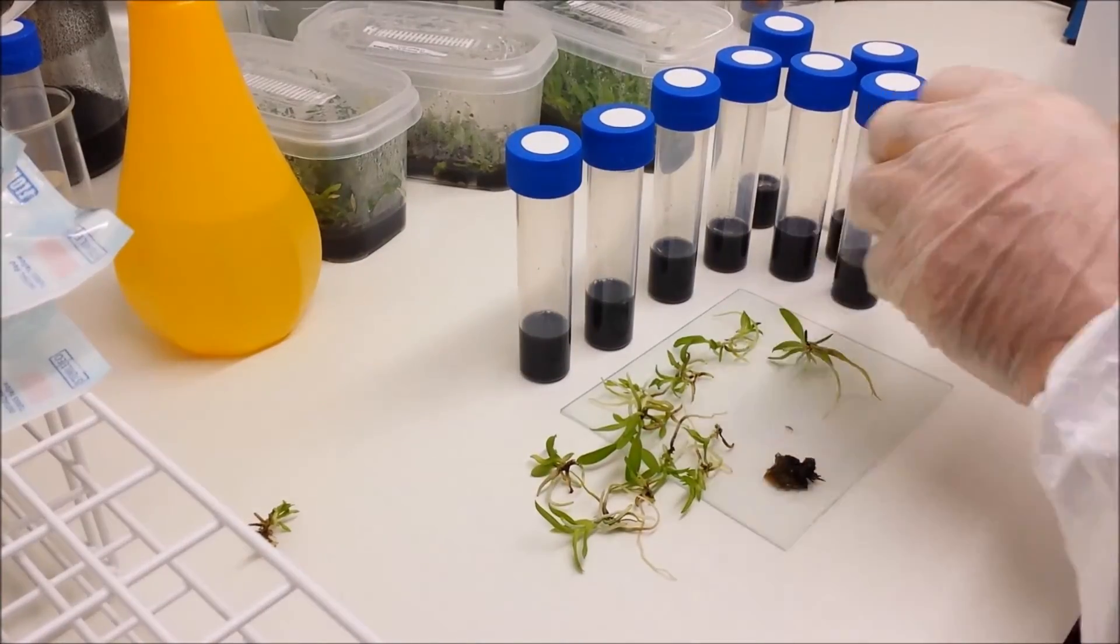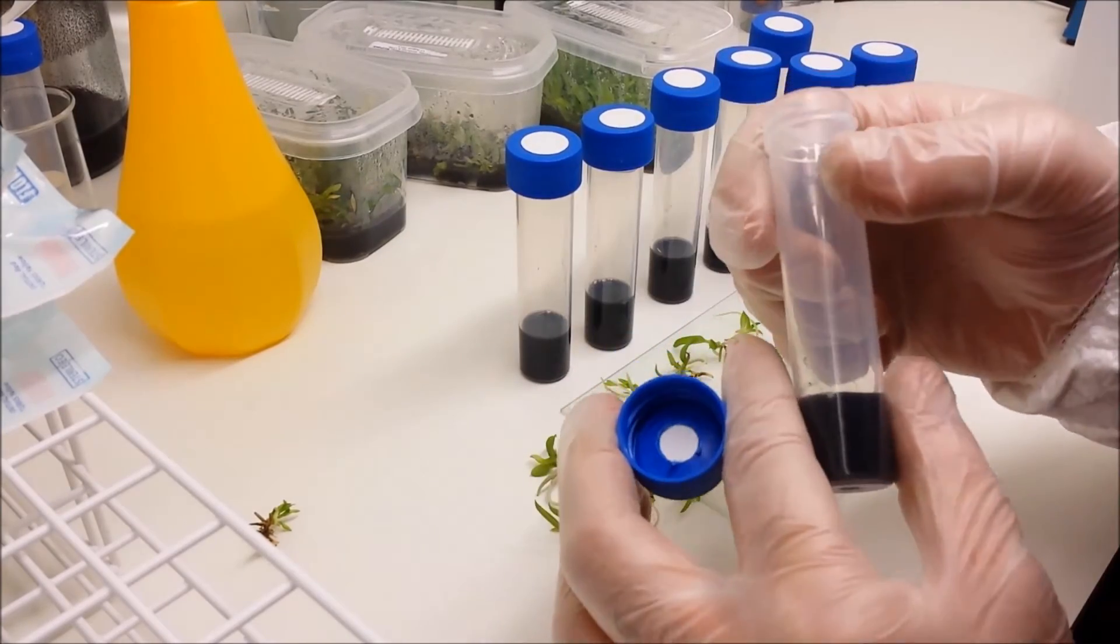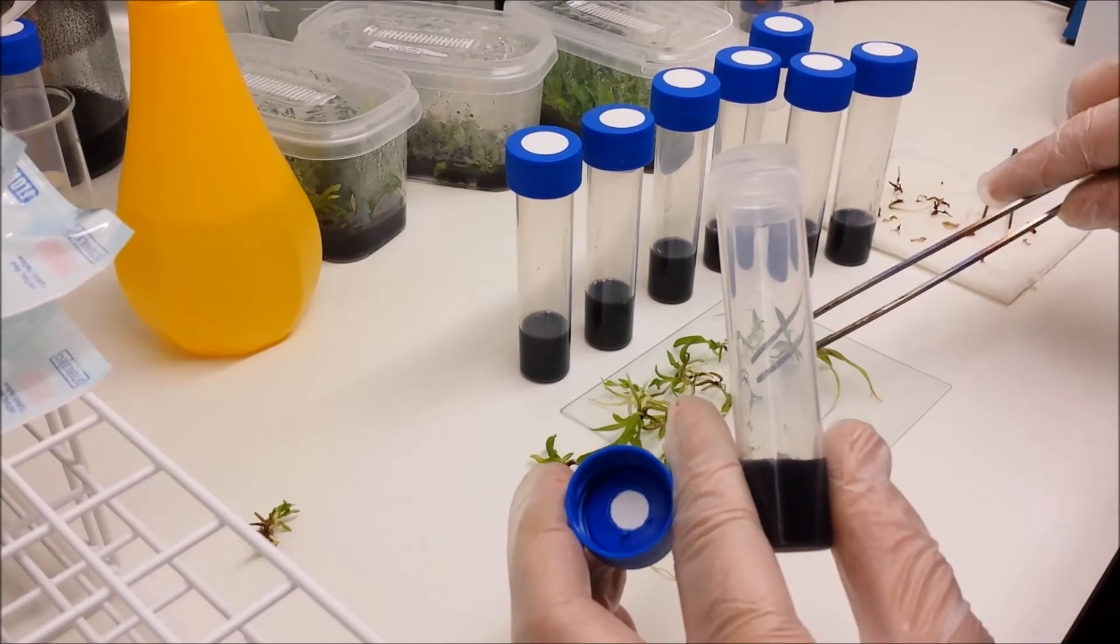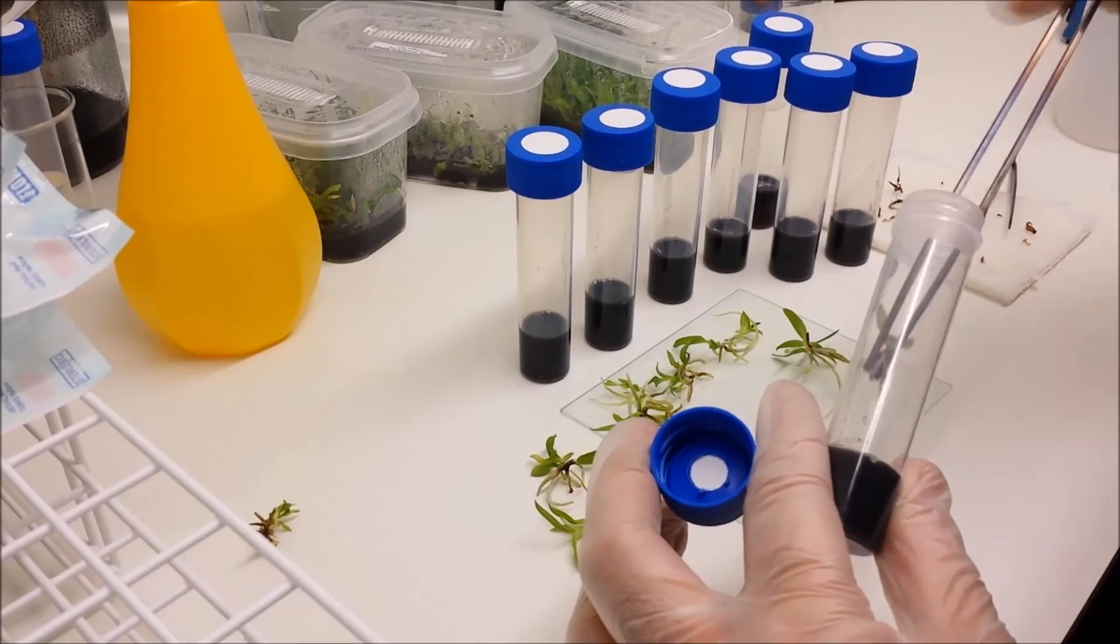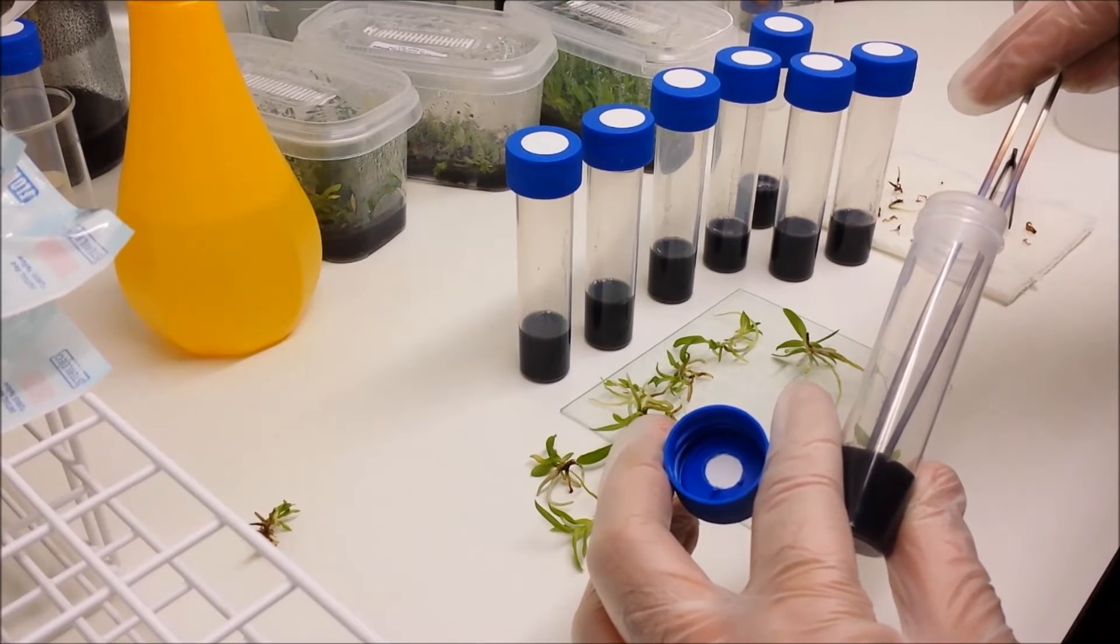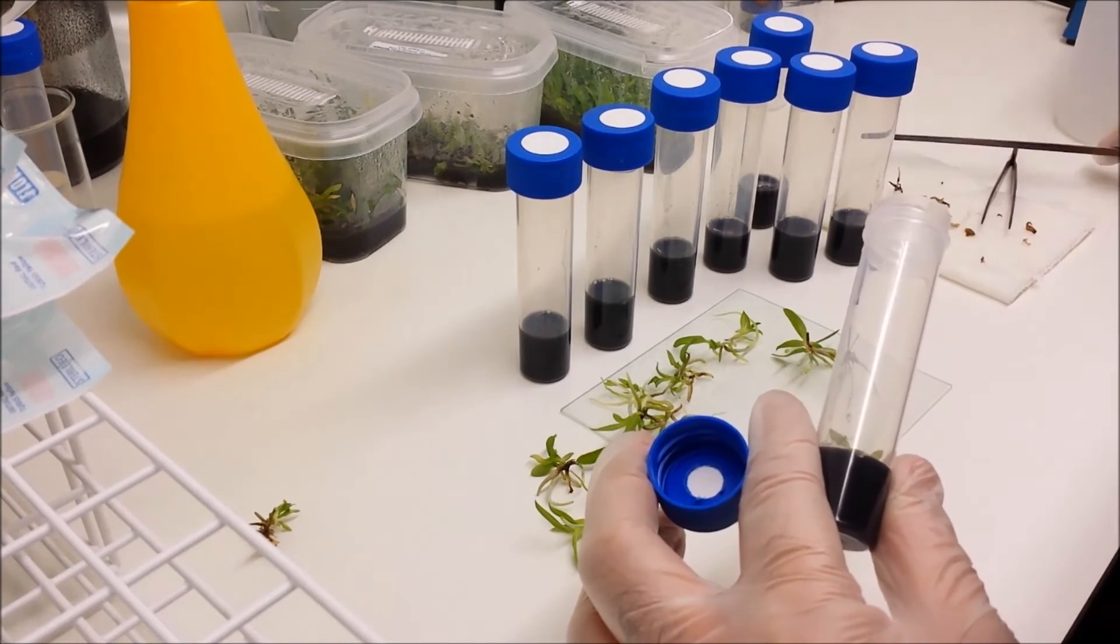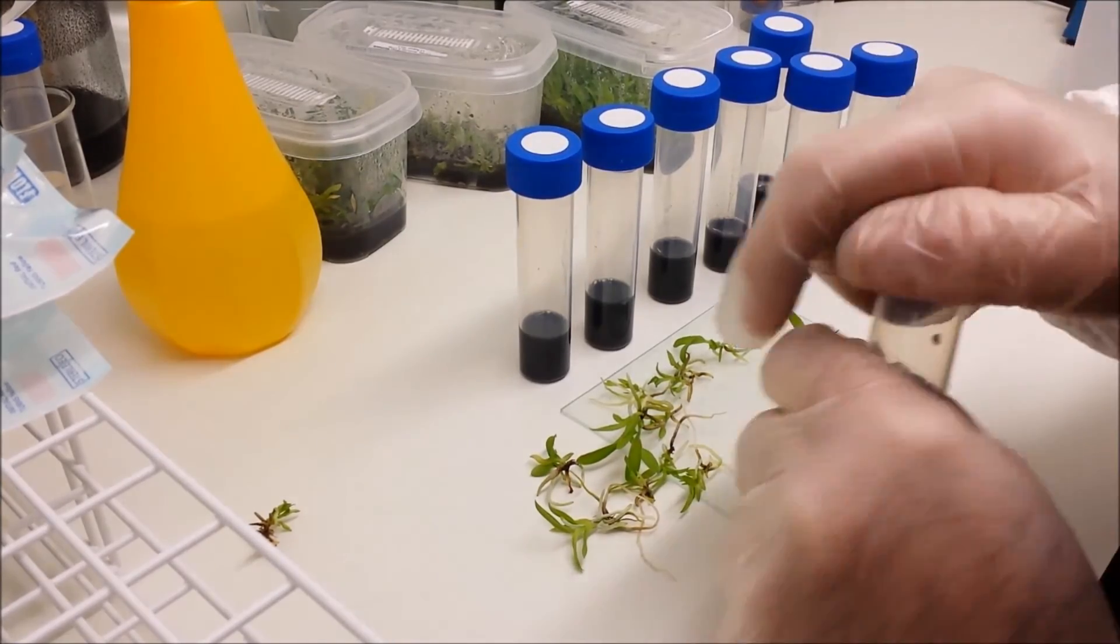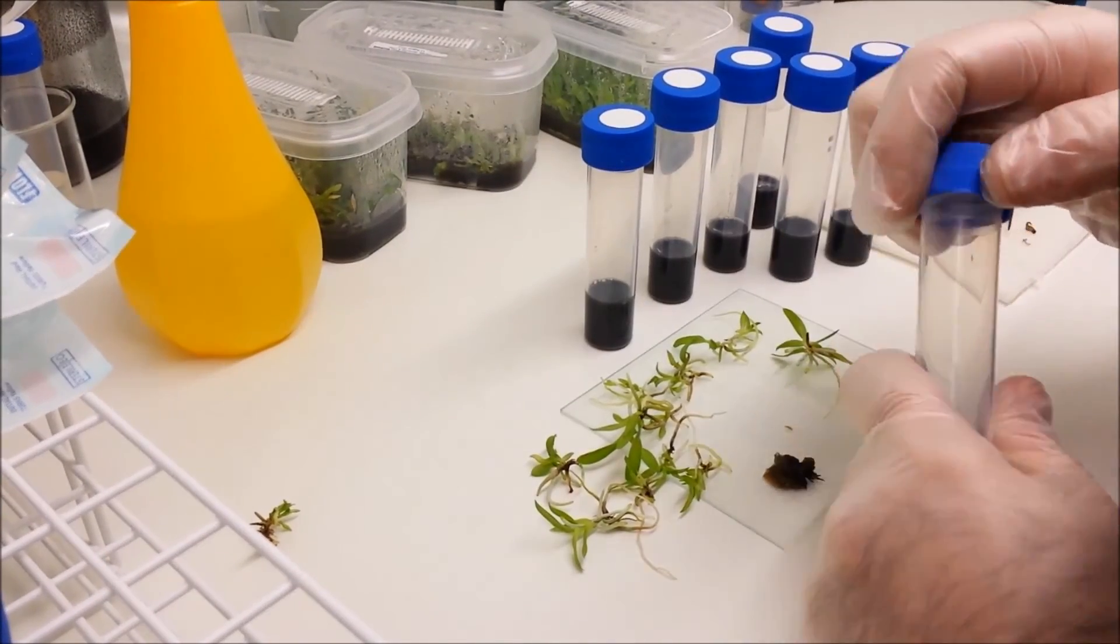Now these will grow away. Temperature wise keep these around about sixteen to eighteen degrees, in reasonable light but not direct sunlight. You don't want to cook them. And they will probably grow like that for perhaps six months or so, by which time it should be large enough to remove from the flask or flasklet and pot up into regular compost or bark.